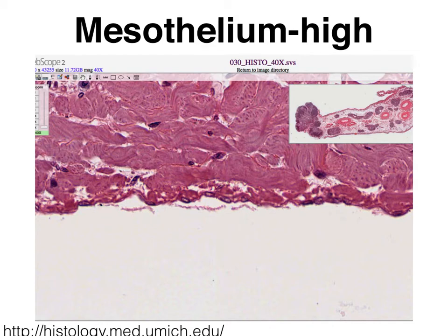Here we're using the 40x objective lens for a total magnification of 400. And this time we can very nicely see the flat nuclei and the flattened cells called the squamous cells that form our simple squamous epithelium. Because of its location, it's referred to as mesothelium. So the name of the tissue is called simple squamous epithelial tissue, but the name of the layer is referred to as the mesothelium.